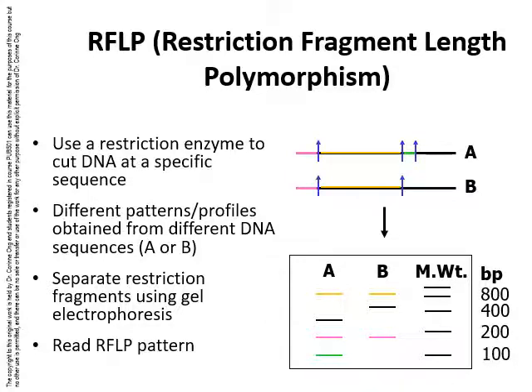In the diagram, there are 2 different virus strains called A and B. They have slightly different sequences, and strain A has a minor sequence variation, which produces an additional third cutting site for the restriction enzyme. This restriction site is absent in strain B, as there is a DNA sequence variation in this portion of the gene. This means that strain B only has 2 restriction sites, and 3 fragments are produced, whereas 4 fragments are produced for strain A because it has 3 restriction sites.